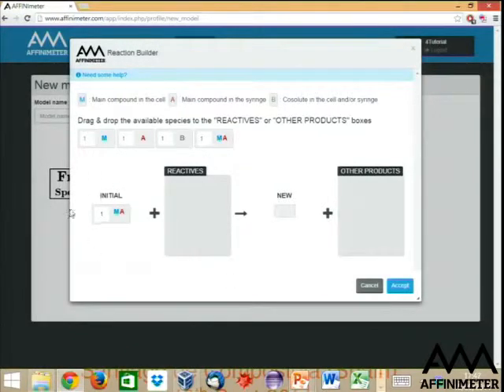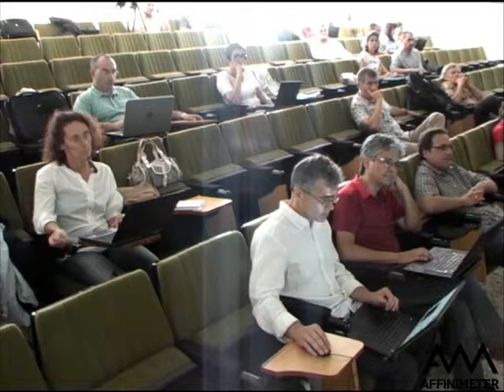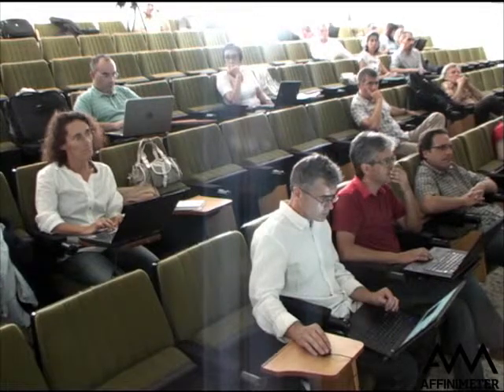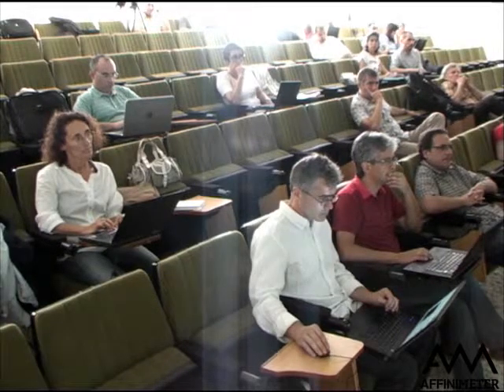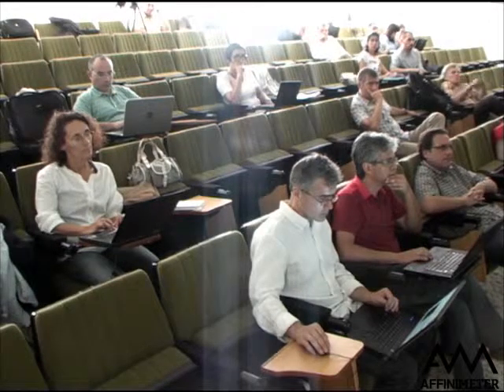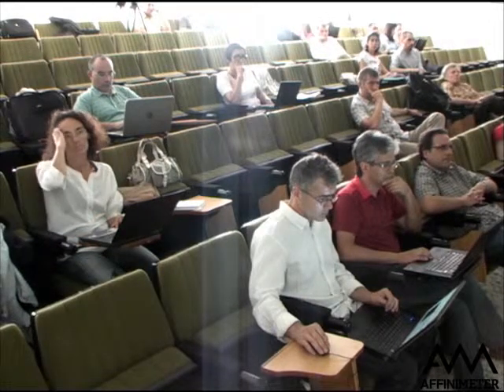So we have the initial complex MA, and we have one more species available here, that is the complex MA. I could consider, for instance, that the complex MA is forming a dimer, right? So I think this is very useful because it gives you a lot of flexibility when the time comes to design binding models based on realistic situations.